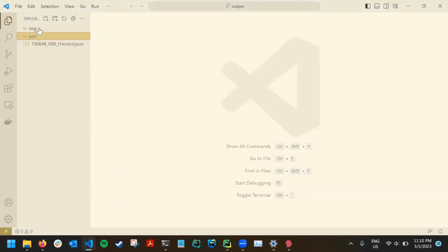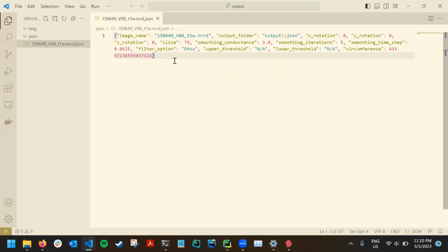It does not export an image per default, but it exports the results as well as all of the settings that were put into it. So if you're a researcher, you want to have these results be reusable, you want all of the inputs to be included.